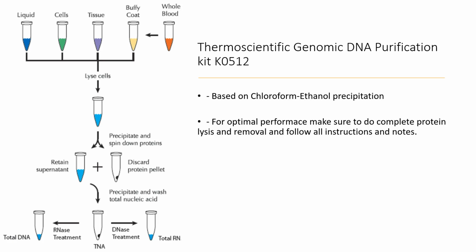What ends up happening in that case is that you get your protein fraction, your organic layer, and an aqueous layer. Your organic layer is going to contain a lot of the proteins. The aqueous layer is going to contain your DNA. And then you can precipitate your DNA and then redissolve it, resuspend it in solution in whatever you need based on what you're going to do with it.